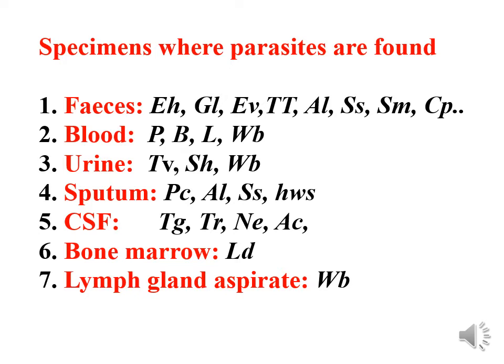AC, Acanthamoeba, and this is now a problem, causing many problems among people who use contact lenses. But the parasite also can cause a sort of meningitis.